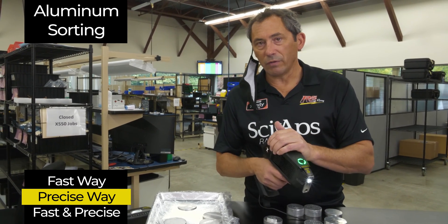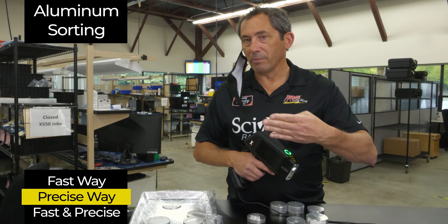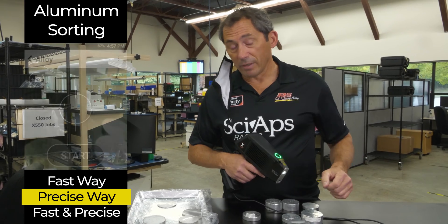We're going to switch over to doing what's called the two-beam test. The first beam identifies it's an aluminum alloy. The second beam measures the magnesium and silicon to really hone in on the exact grade. I'll give you some examples compared to last time.